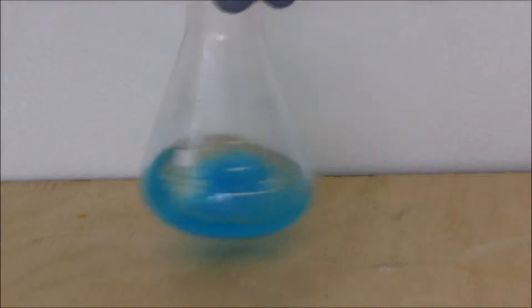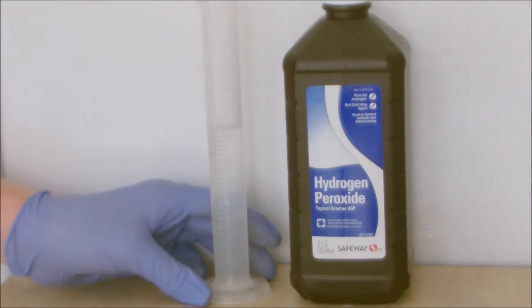Now we mix up the solution. For this experiment we really only need one milliliter of the copper sulfate. The next step is measuring out 30 milliliters of hydrogen peroxide.